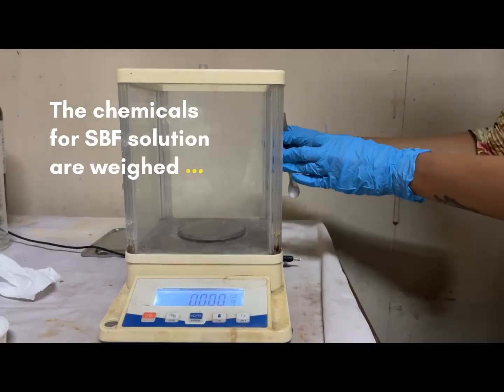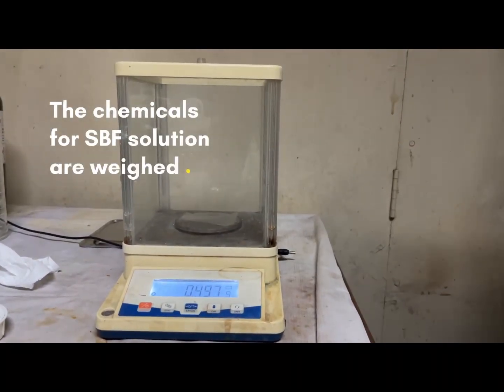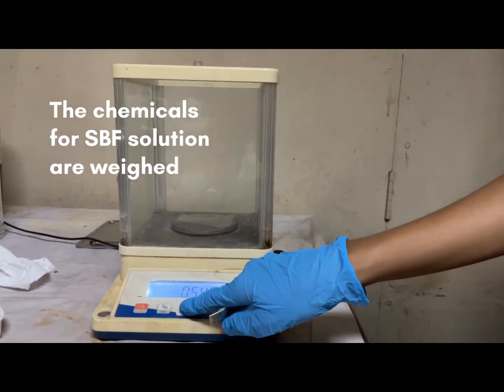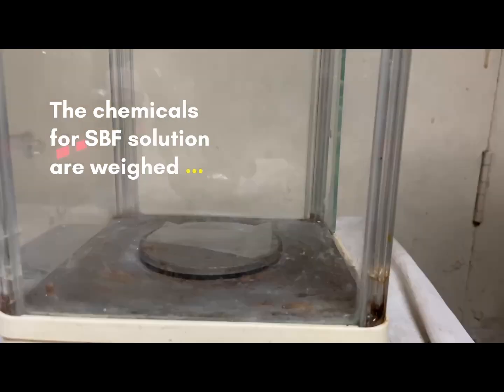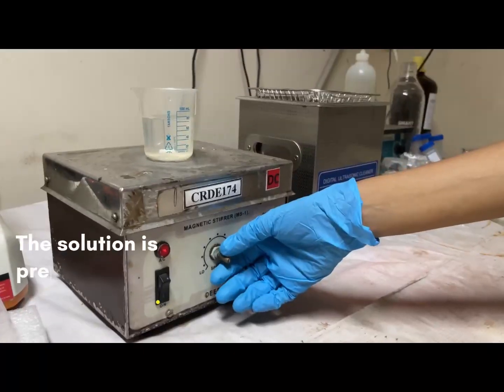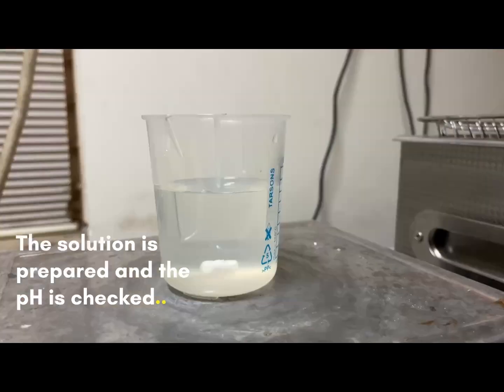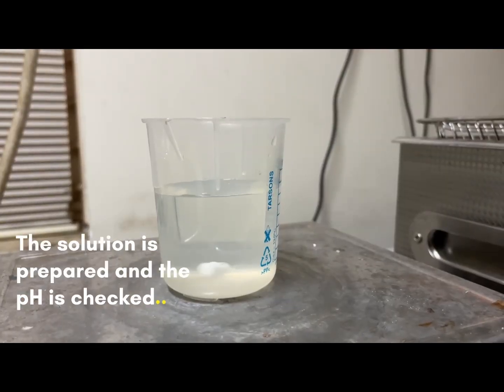Now we will see the demonstration. Before starting the experiment, the suitable electrolyte is prepared, and then the solution is stirred for the preparation of a homogeneous mixture.